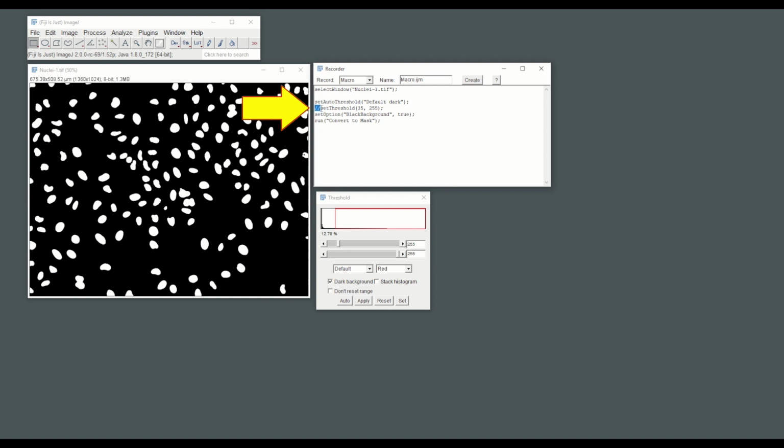Sometimes you will see these commands recorded with a double slash. This is a background command that was recorded together, and most of the time it is not required for running the script, so we can remove this one too.